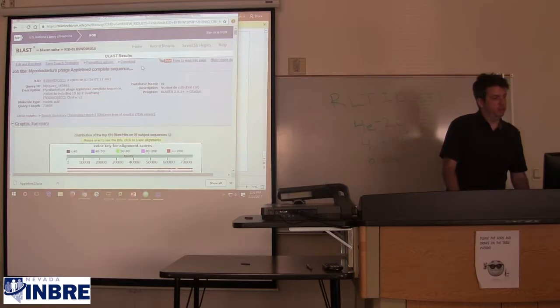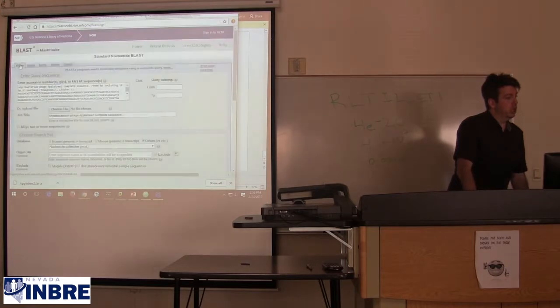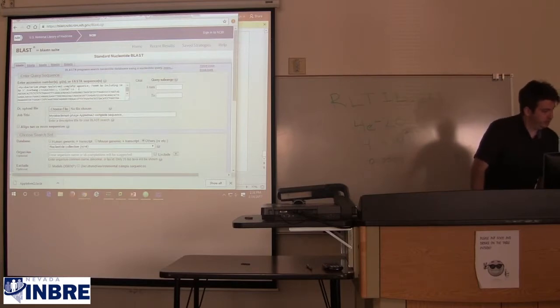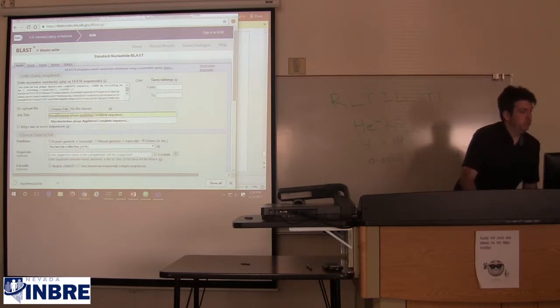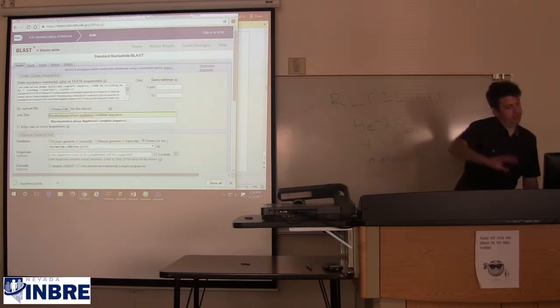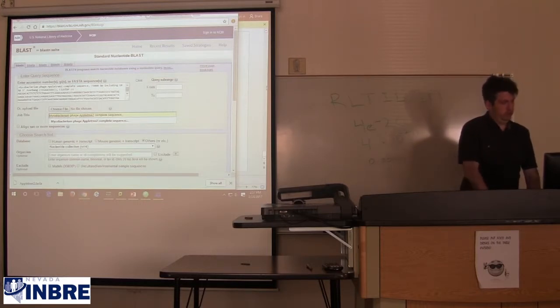If you have any of our given result pages up, you can hit edit and resubmit, and we'll get back to that build-your-query page. So for the Blastn search, we see that it's our Apple Tree 2 complete sequence. Here's where we could be giving them unique names, and because it truncates them with dots, for our later perusal, at least during the next 36 hours before they get wiped out, we could name it versus smegmatis.